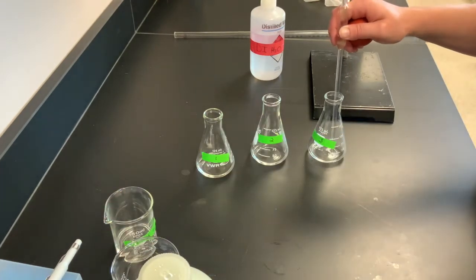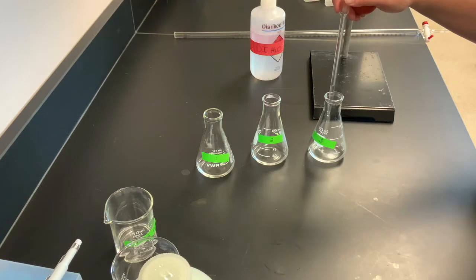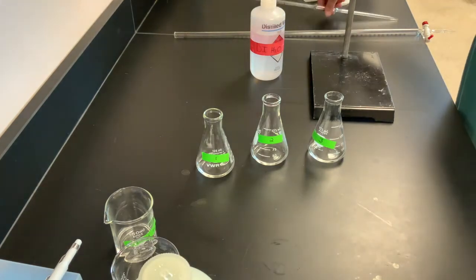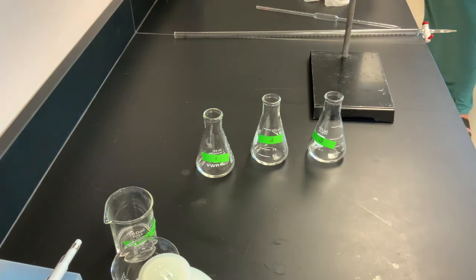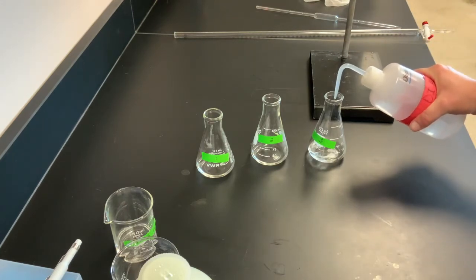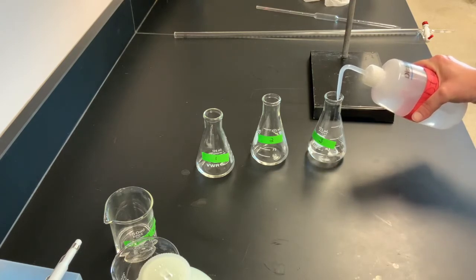So here we've got our hydrochloric acid and our flasks. The next thing we're going to do is add some deionized water. We don't have to be accurate here with the deionized water. This particular acid, we already know its concentration. Adding the water is not going to alter that. So we're going to add it. We get to about the 50 milliliter mark on our flasks. And again, it doesn't have to be accurate. Just as close as we can get it. So we've got 50.